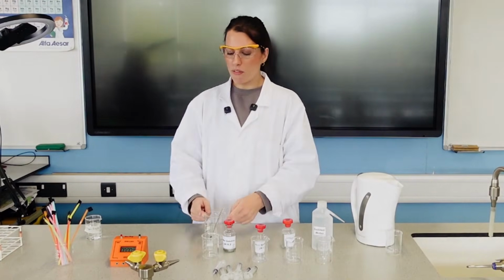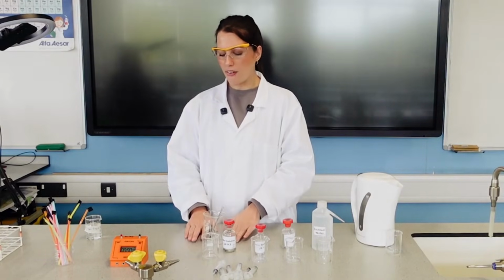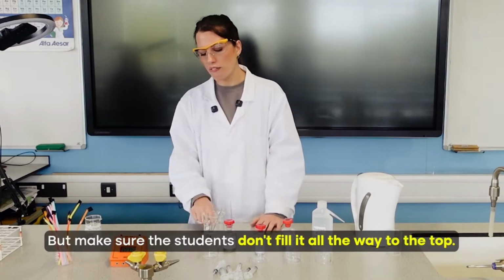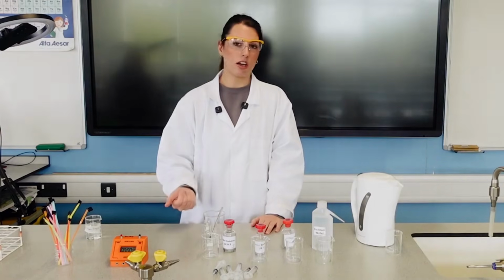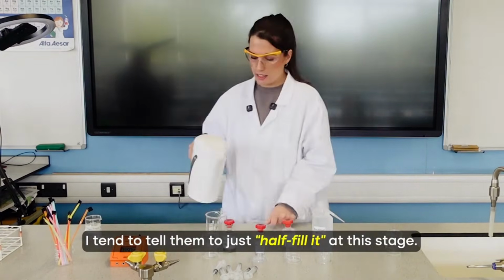Now, it doesn't matter what volume of water they're using in the water bath, as long as you have a large enough volume to cover the test tubes, but make sure the students don't fill it all the way to the top, because then when you put the test tubes in, that is going to cause it to overflow. So I tend to tell them to just half fill it at this stage.